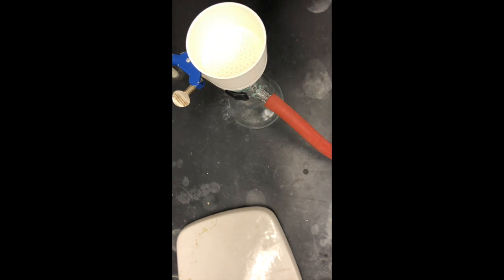Again, the whole idea of recrystallization is that we're trying to purify a given solid that has a small amount of impurity. It's typically a very last step in an experiment. We'll have a later experiment in the term where we do a recrystallization step towards the end.